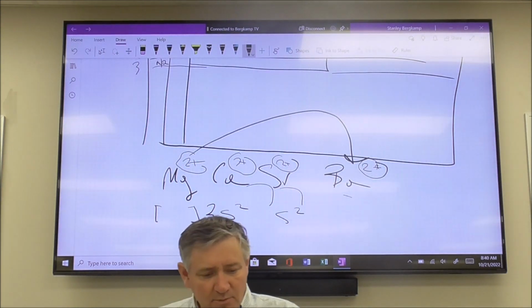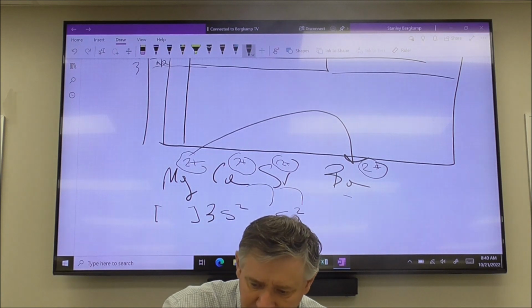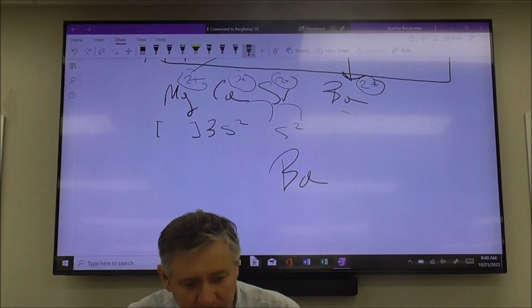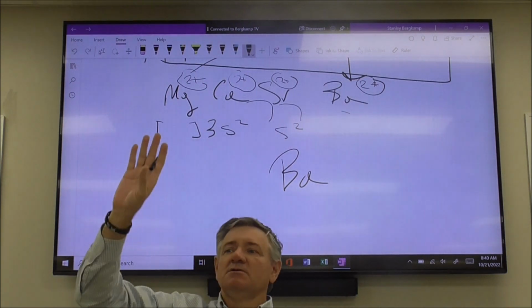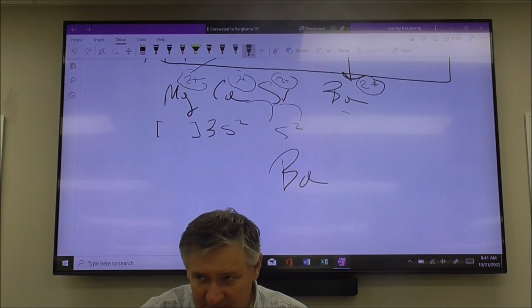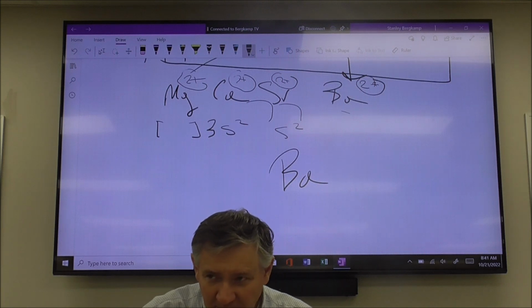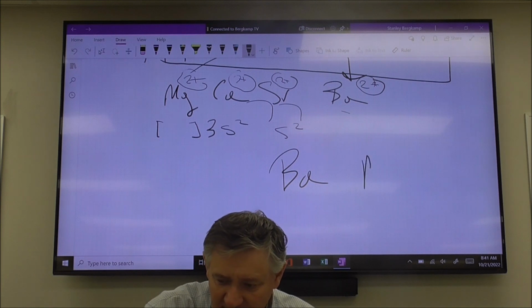Barium runs into, for example, that carbonate. So when you reacted barium chloride and sodium carbonate, did that form a precipitate? Ella, look at your data table. Barium chloride, BaCl2, and sodium carbonate, Na2CO3.